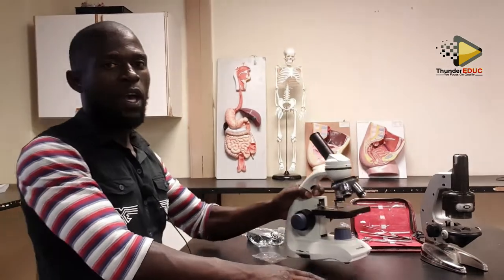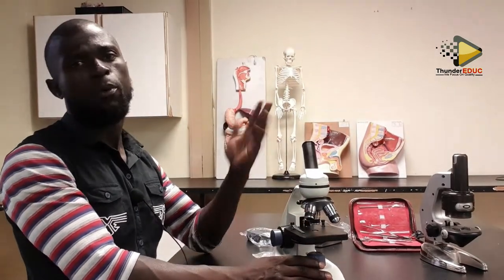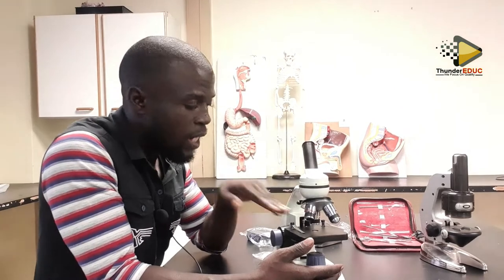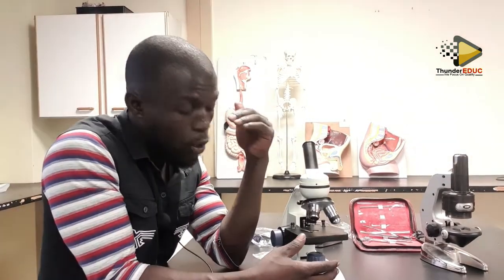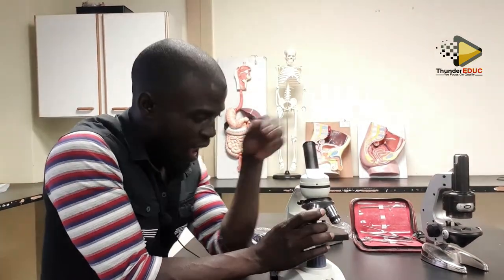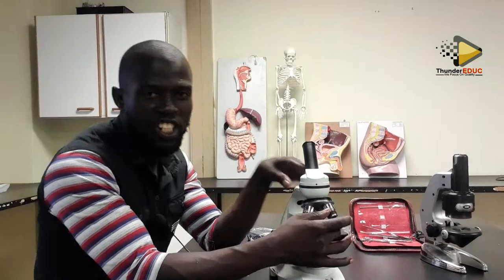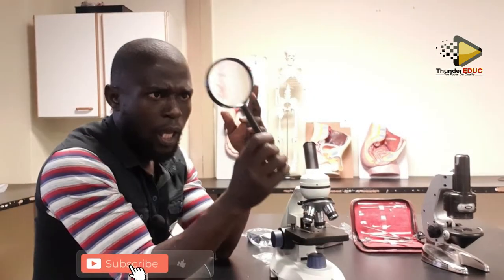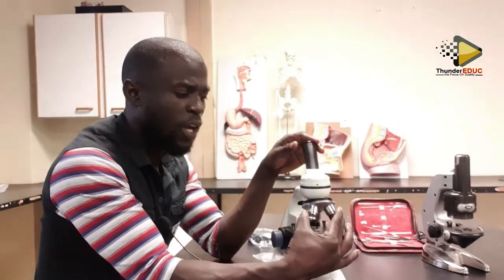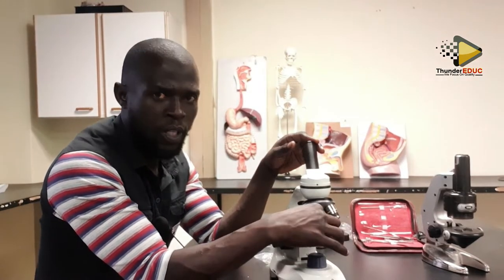All right, number two, we have what we call the compound microscope. If you're not simple, you're compound, or complex. Compound microscope is called that because of the different lenses it has. It has this lens here, and then it has these lenses. When you are using it, you only use two lenses at a time, the eyepiece and the objective. So why does it have a lot of lenses here? These lenses are here to change the magnification. In the simple one, the magnification can only be obtained by changing the distance, while in these ones, you get it by changing the lens you are using.